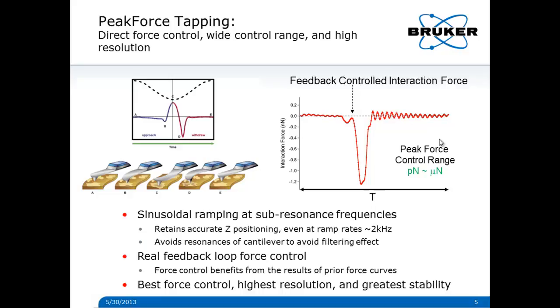In PeakForce Tapping, by contrast, we have direct force control, and we are modulating the tip position here with a sinusoidal motion. This gives us the greatest possible ramp rates without exciting piezo resonances, but we do this at well below the resonance of the cantilever. So this sub-resonance modulation of the tip avoids the filtering effect of the cantilever transfer function. So we can actually see the entire curve.